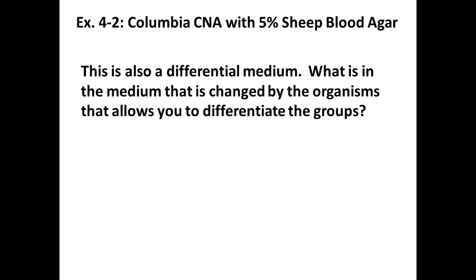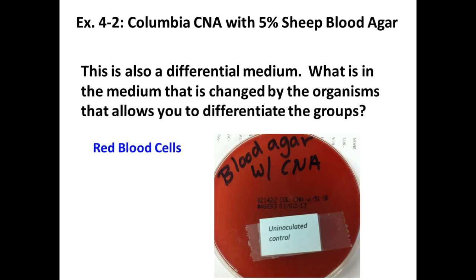So unless you have whole red blood cells, this media isn't going to work, right? So you need red blood cells, whole red blood cells, not broken. This is the differential agent. This is what's going to be changed by the bacteria. That's why these plates look blood red. They literally have blood in them.